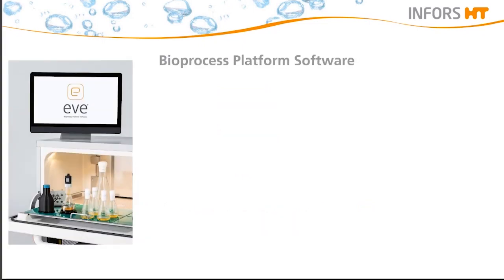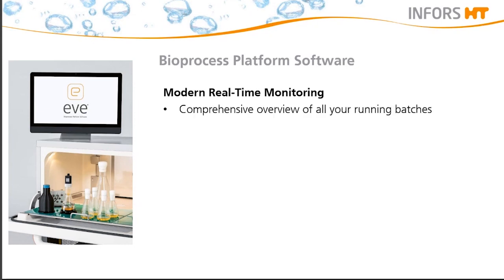As Lea already mentioned, in situations we are currently experiencing, access to the lab might be limited. But even in scenarios where lab access is not restricted, it is important to have the ability to control and monitor your processes precisely in the shaker. Therefore, EVE, a bioprocess software platform, provides all necessary features required for a successful cultivation. Firstly, the ability of modern real-time monitoring means you can have a comprehensive overview of all your running batches and control whether all your shakers are running on a specific set point.